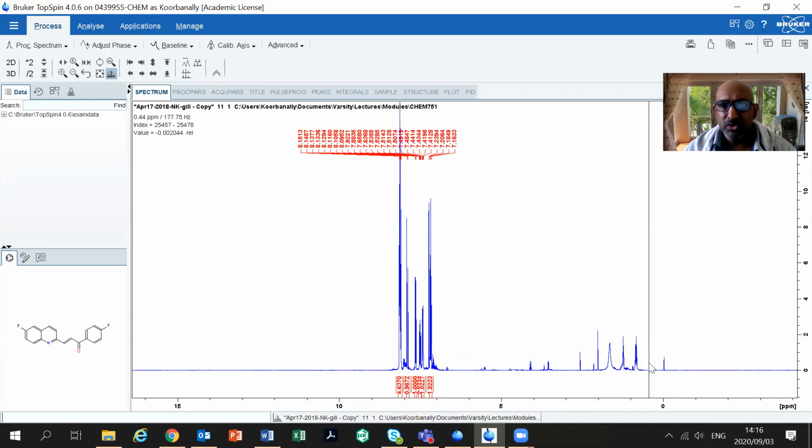Now, perhaps the student should have actually gone back to the lab and purified it until such time that all these peaks have actually disappeared into the noise, right? So if these peaks disappeared, you know, this sample here, I wouldn't say is 99% pure. This sample that we have here is probably about 85 to 90% pure, right? So it's not a real pure NMR spectrum, and I can tell that because of all these impurity peaks here.